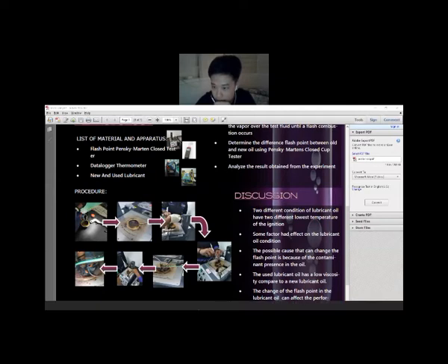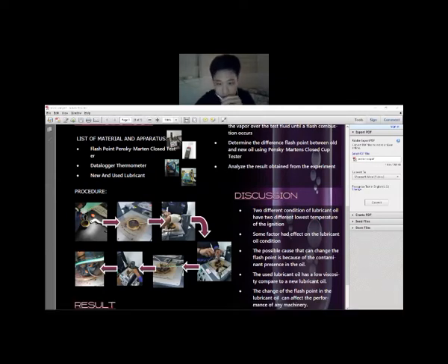The test flame is opened, then the natural gas is maintained at a stable output. The diameter of the test flame is adjusted to a range between 3.2 mm and 4.8 mm. The heat is applied at such a rate that the temperature indicated by the temperature measuring device increases 1 to 1.6 degrees Celsius per minute.